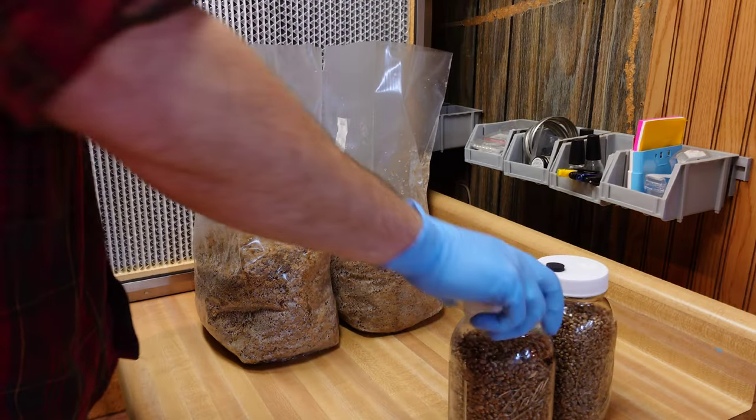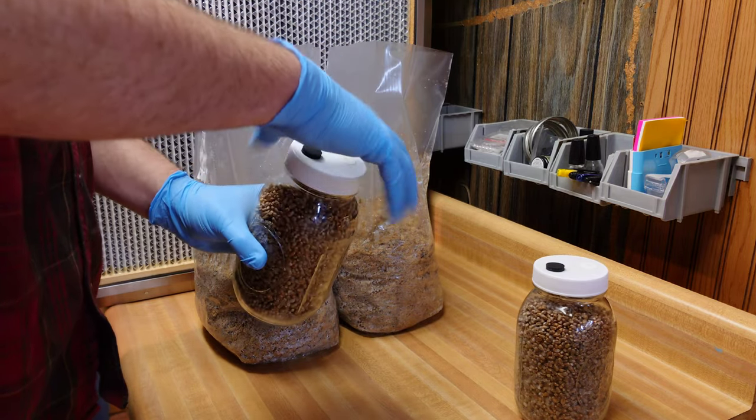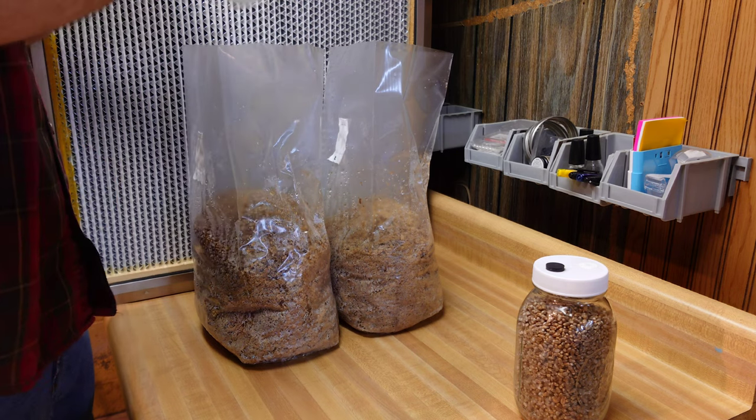I'm also inoculating a couple of bags with some grain spawn I made previously — this is some reishi grain spawn for another project — just to show you what it looks like. Very similar process: shake the grain up, drop it in the bags, and reseal.